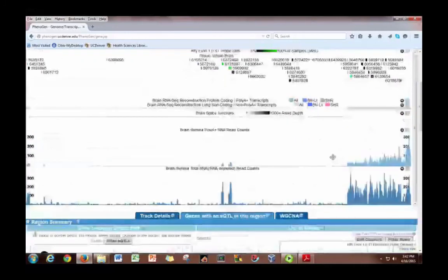So with our RNA-seq data, we can also use that tool to expand it to get what we're familiar with here as almost a histogram of RNA expression. And so what's nice about this layout, some of the reconstruction methods aren't all that fabulous, and sometimes they tell us things that are a little strange. So what this is designed for is for you to go through and visually validate what it's done. So we definitely see higher expression at the exon levels, rather than the introns.